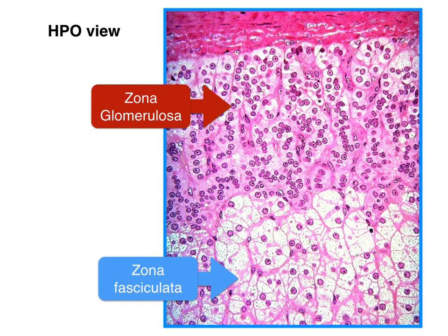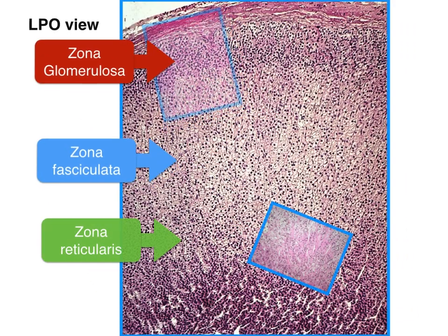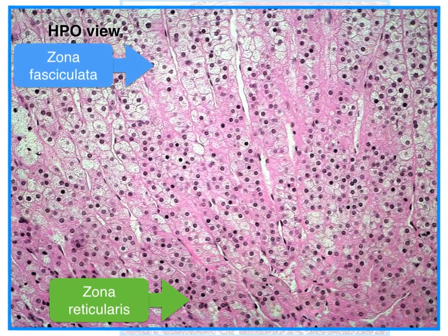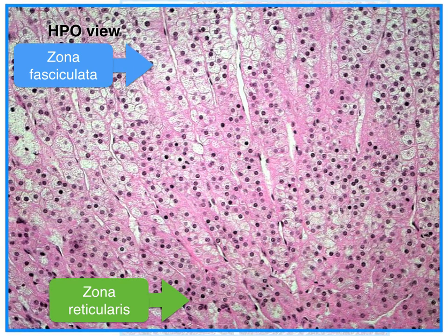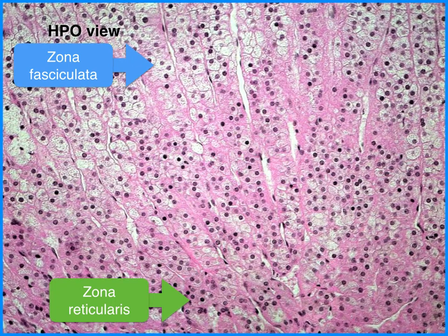The zona glomerulosa is the thin outer layer of the adrenal cortex. Its cells are pale staining and organized into ovoid clusters. The cells of the zona glomerulosa produce mineralocorticoid hormones like aldosterone. Just below this sub-layer is the zona fasciculata, which comprises the thick middle layer of the cortex. Its cells are very pale because of the presence of lipid droplets, and organized into parallel cords. The cells of this region produce glucocorticoids like cortisol. The deepest sub-layer of the cortex is the zona reticularis, the innermost layer of the adrenal cortex. Cells in the zona reticularis stain deeply, and this region produces androgens.